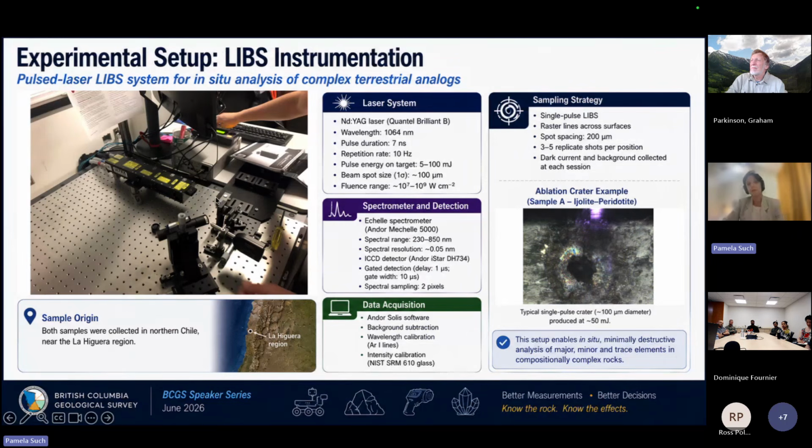So for the experimental setup, we chose a very potent 1064 nanometer laser. This is the laser. We chose the distance of the laser so we can calculate a specific power that we want to shoot on the sample, and then we put the sample in this position here.